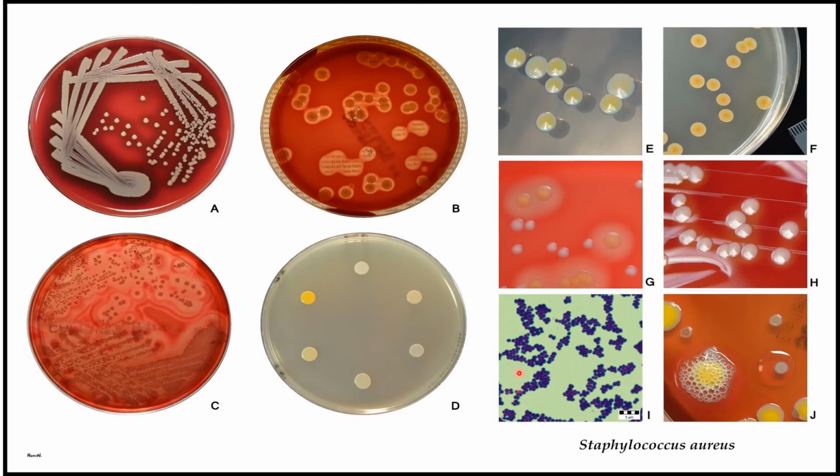So this is the gram reaction of Staphylococcus aureus, so grape-like, gram-positive, and again depending on the strain, sometimes they appear golden. That's why aureus, like gold, yellow color. Some strains, of course, lost pigmentation, like they kind of produce white colonies. Again, some strains are hemolytic, others are not, like just alpha hemolytic.